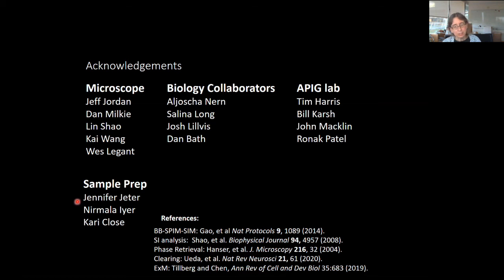So for the ideal case, it's a many-part question. For people doing expansion microscopy, we built two lattice light sheet microscopes here at Janelia specifically to do expansion microscopy, and we're using the 2 millimeter working distance water dipping objective from Nikon.